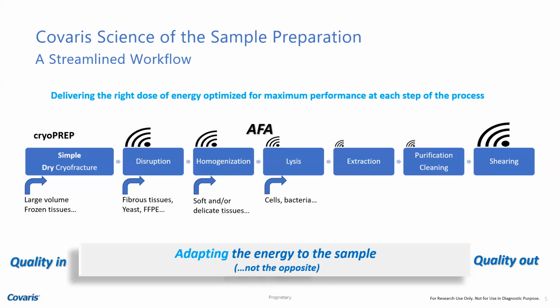So that you do not cook the sample, you do not heat other parts of the sample or the tube or the plate if you don't wish to. So that's one advantage. But another thing is you can change the power. So what does that mean? That sometimes you need a lot of power to go through certain types of tissues, let's say skin, brain cubes, and sometimes you don't need as much power.